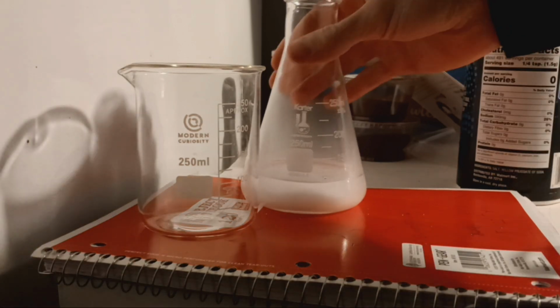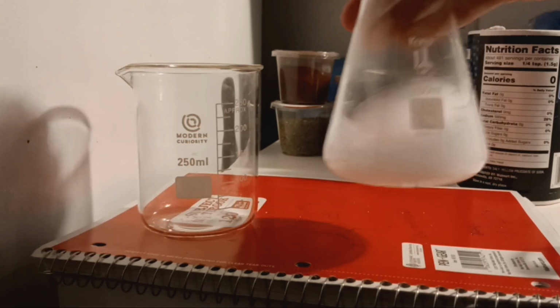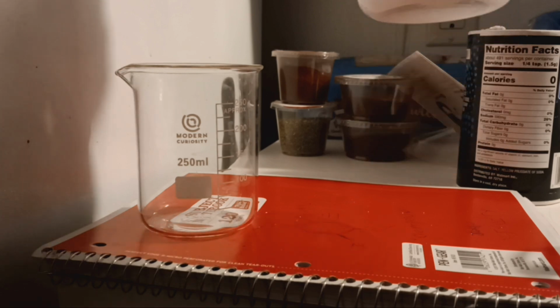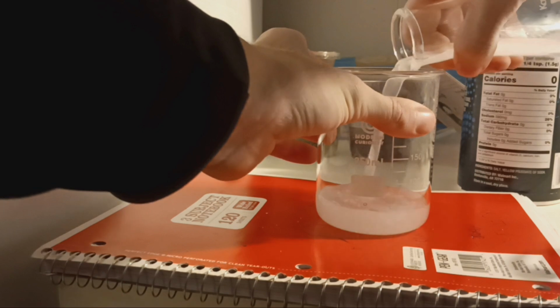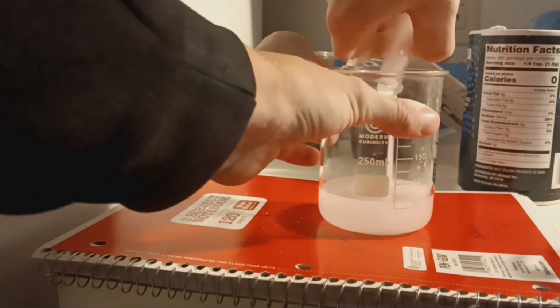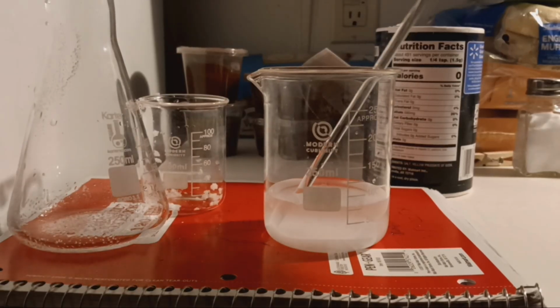I first fix a major mistake from last time, which caused us to waste some of our precious salt. I reduced the number of containers the electrolyte solution had to be transferred through. This results in a net positive of salt not being lost. However, I made a new mistake. My water was not hot enough, and so the salt could not dissolve.